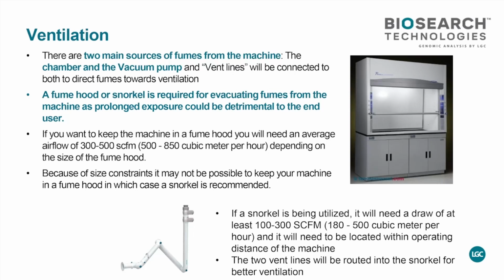It's a pretty smelly chemistry. For us chemists, the smell of pyridine in the morning is actually delightful, but for your office folks, when they smell it, they're going to think something died. So you want to be considerate to your colleagues that do not work in the chemistry lab. Ventilation is important.